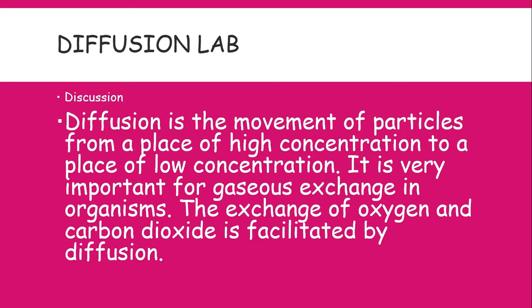The discussion, that's what comes after your observation. But your discussion usually begins with background knowledge, and the background knowledge is just a little bit about the content you are covering, and of course probably the importance of what you are covering. So here we said diffusion is the movement of particles from a place of high concentration to a place of low concentration. It is very important for gaseous exchange in organisms. The exchange of oxygen and carbon dioxide is facilitated by diffusion.